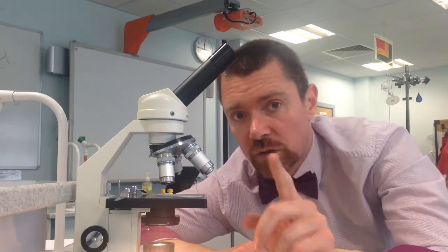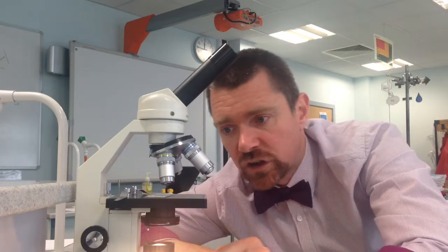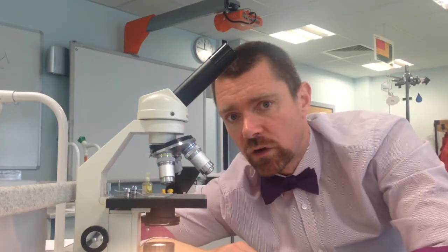You put the bit of the microscope slide where your sample is over the hole in the stage that the light is shining up through. And once you've got your microscope slide in place, you use the clips to hold it there so it doesn't move around all over the place.